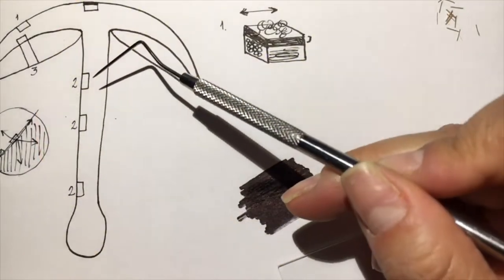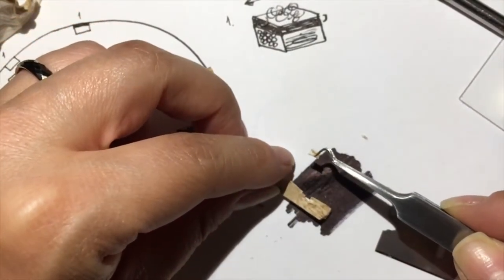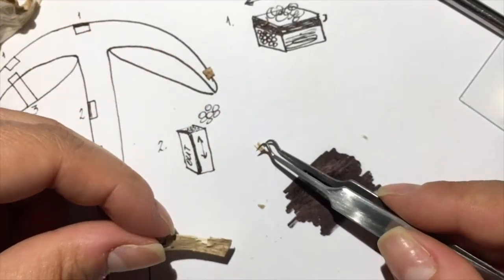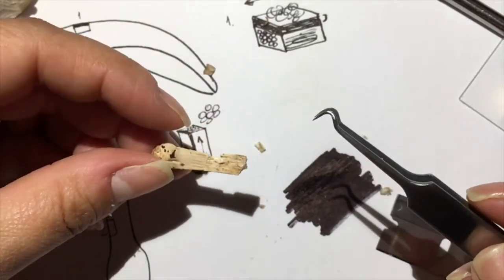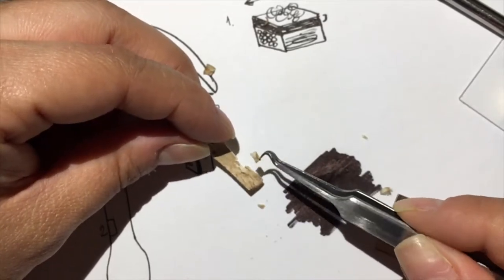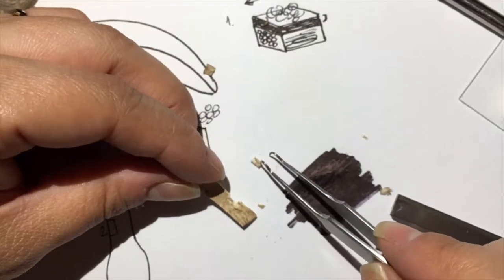This one's going to be longitudinal sections. You can see our little square. So remember always the orientation. So right now, yep. So this is this part. Make sure you're not flipping over. Okay, so that's our box.